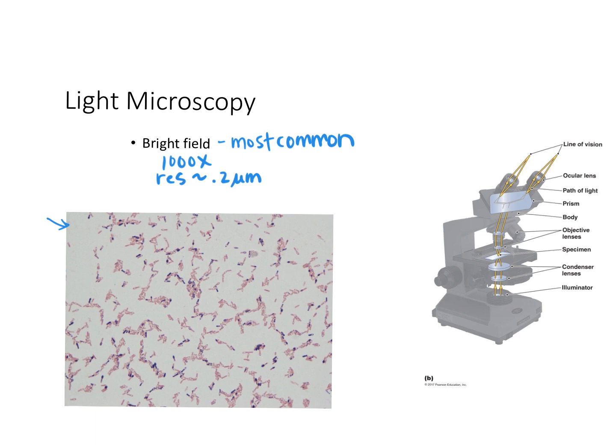Okay, so the parts of the scope, I think I included a couple of homework questions asking about the parts of the scope, but just kind of for practice, but primarily going to leave that to your lab instructor. Ocular lenses, like we said, objective lenses. Underneath the stage, there's going to be some condenser lenses and an iris diaphragm, which is just a little lever that controls the amount of light that comes up through the stage. Totally okay to mess with that lever a little bit to get kind of the right amount of light.